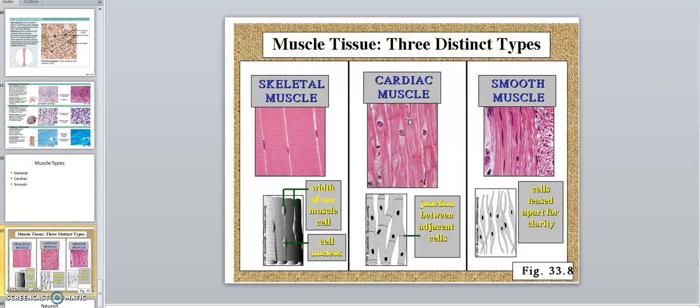Look back at what I'm talking about. That's these junctions. Those are called intercalated disc. So if I show a slide with no name on it, you'd say this is skeletal, that's cardiac. Smooth muscle, you can see, has no stripes in it at all. This has little stripes in it. This would be like in your intestine and so forth.